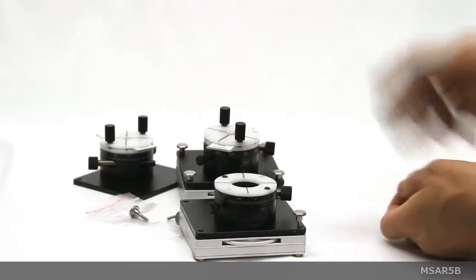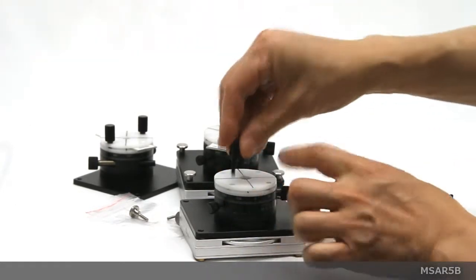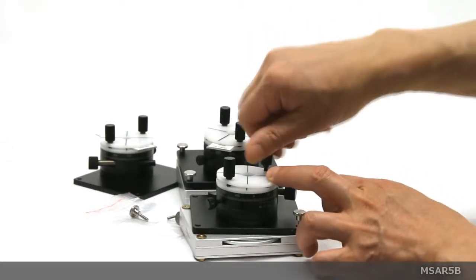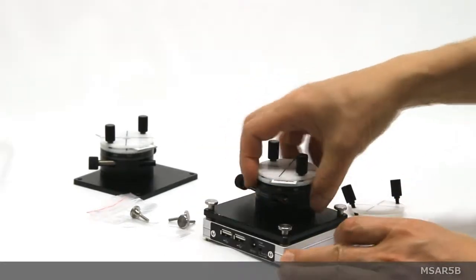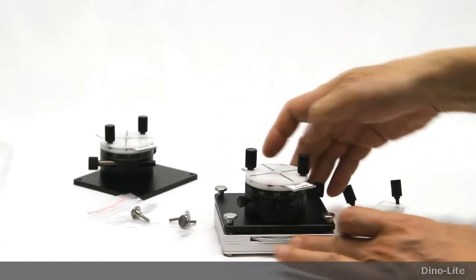Use the two included black thumb screws to connect the top disc to the MS-AR5B stage. You can place a slide for viewing beneath the top disc and tighten the thumb screws to secure.